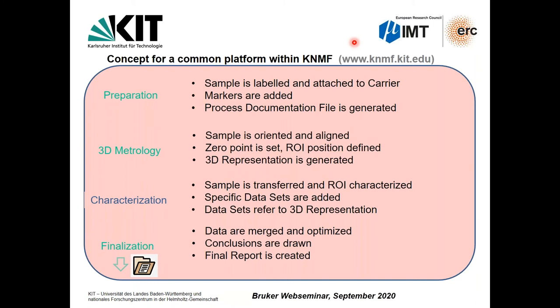If you want to connect different machines and get results from different perspectives, you have to look at different topics, like how to prepare your sample so that it can be subsequently measured or treated. You need a really 3D metrology, because if you keep everything in a plane, a lot of samples are excluded, and we don't want that. But on the other hand, if you start thinking about 3D metrology, the referencing is much harder than just keeping in plane, because in plane you have three markers, you look at them, you calculate the position, and then everything is done. If you look at a 3D representation, it's much harder.